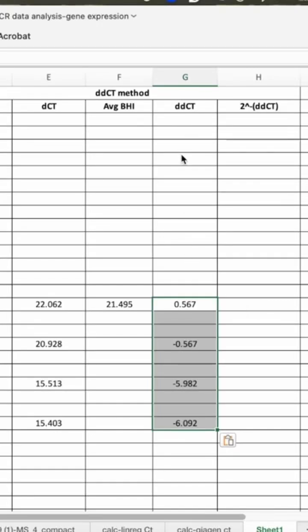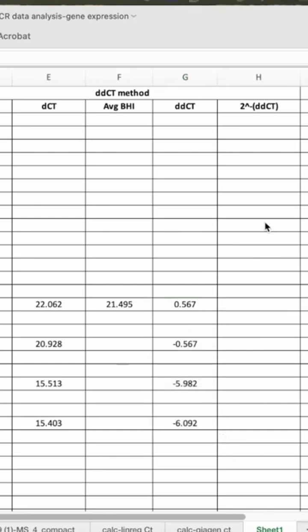We got the delta-delta CT values from all of these conditions, treatment conditions, and now we will be calculating the fold change.